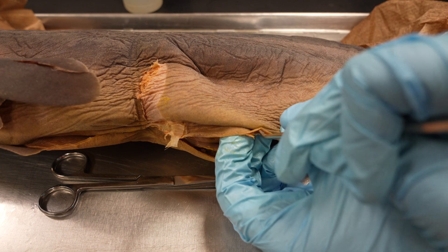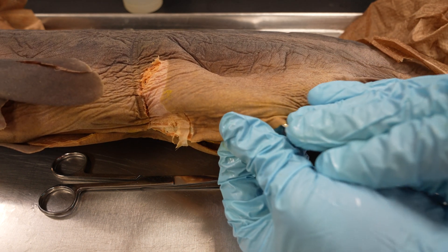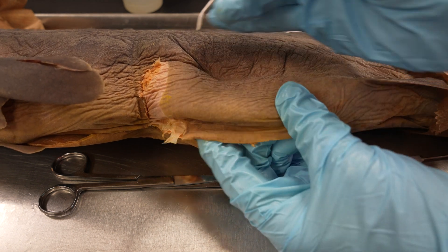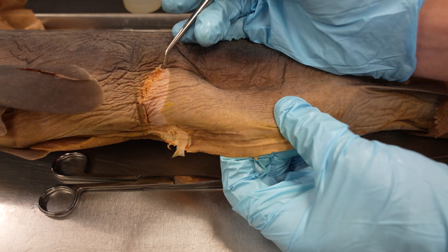Oh, before I keep going — you're going to encounter a lot of really tough fascia when you're doing this. It requires a bit of patience, and don't get too overzealous like I did over here.